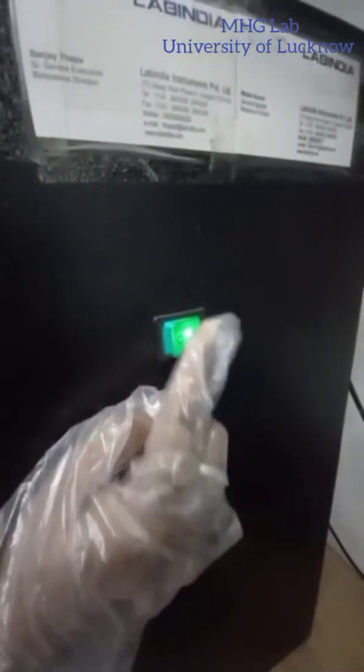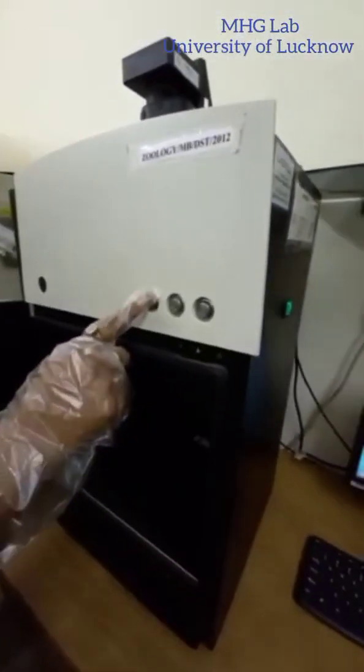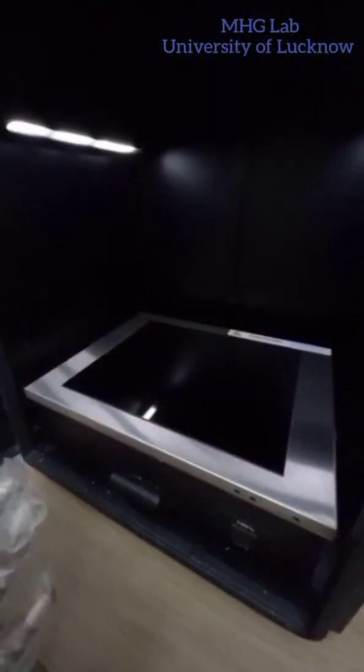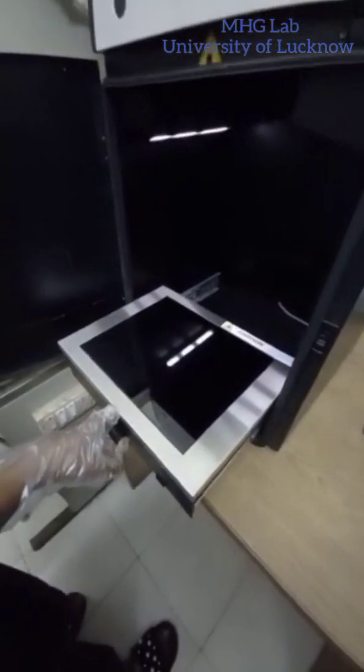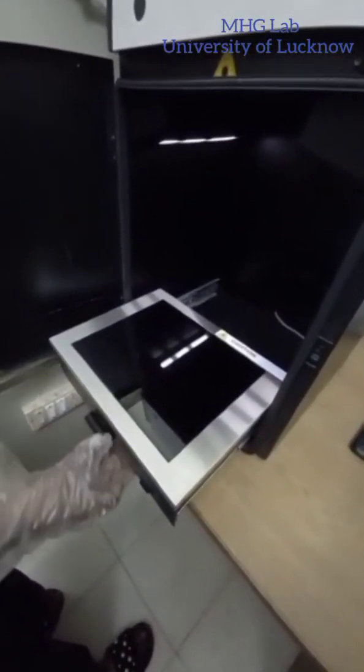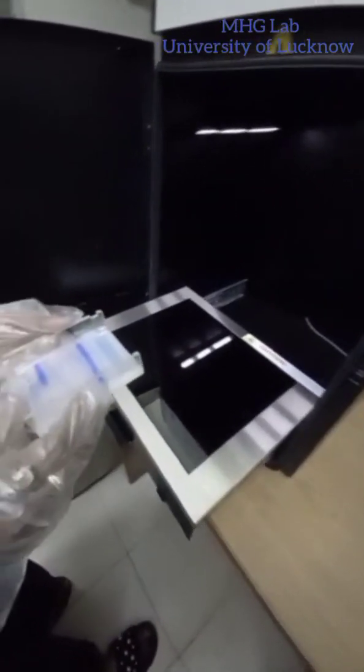This is green button, this is off and this is on. So when white light is pressed, the chamber illuminates. Then we can pull this board out and this is our agarose gel which we have run earlier.